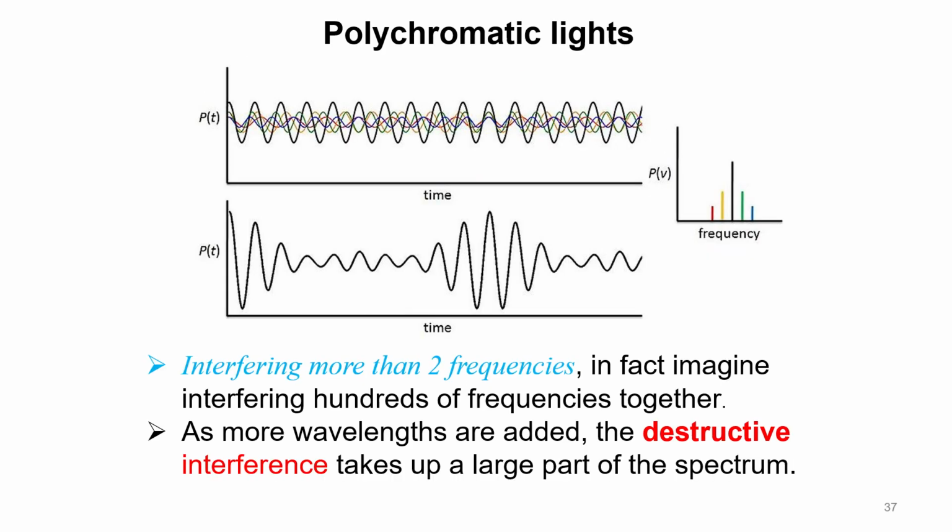As more radiations varying in wavelength are involved as the light source, or if the light source is a polychromatic light, then they will have different types of waves present, and it will go through the process of interference and result in this type of time domain spectrum.